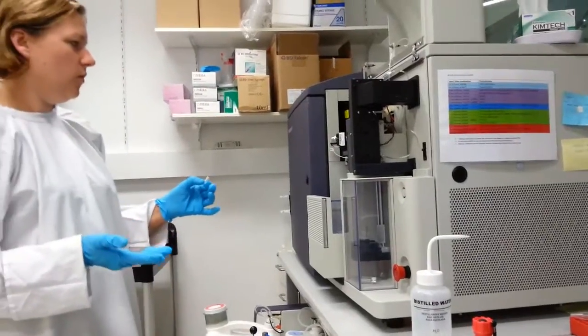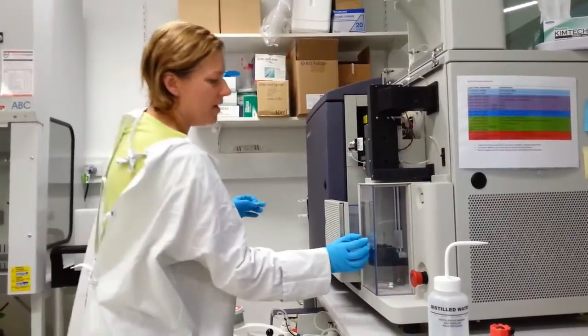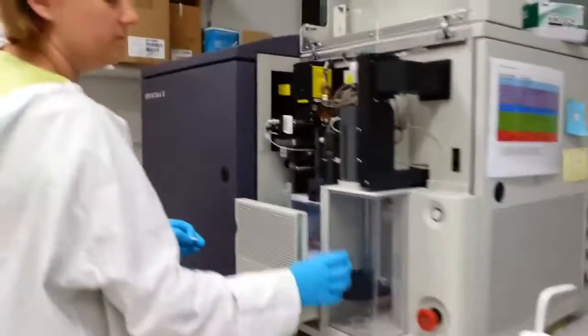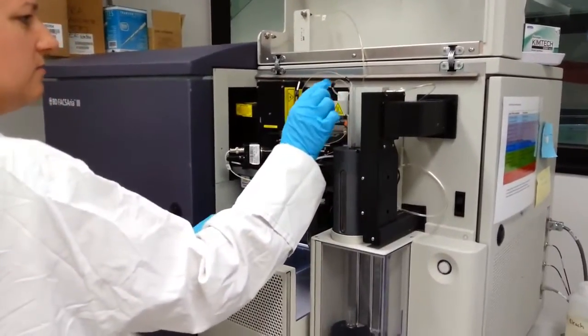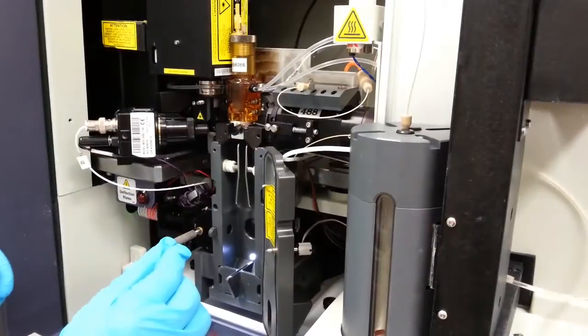This machine works by a sample of mixed cells coming up here into the sample chamber. The cells travel up these tiny tubes.